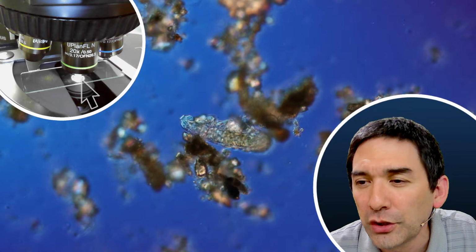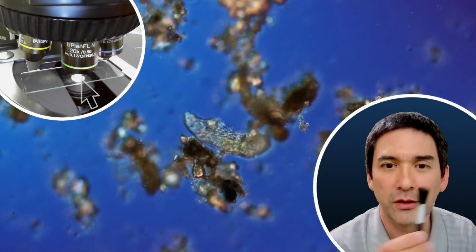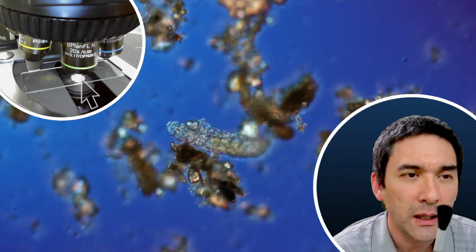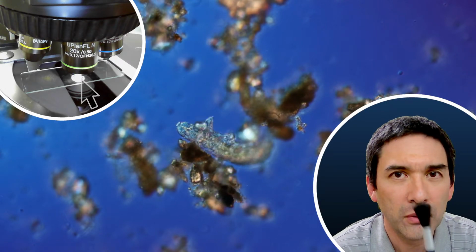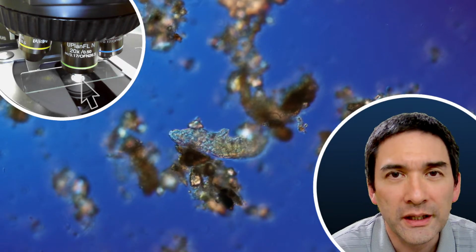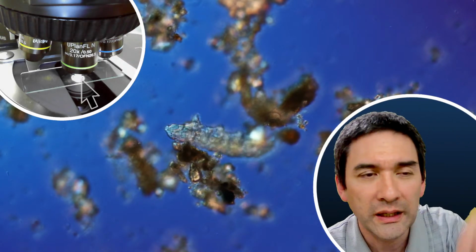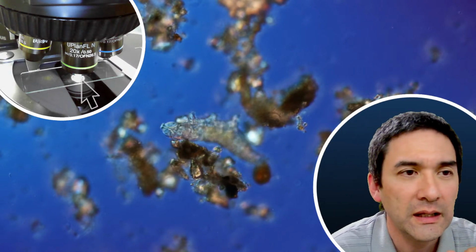What about a brush? The ones for glass surfaces... where's my brush? Look what I got here. Okay. Yes, as a matter of fact, I use this brush here, but I do not use it directly on the microscope objective, because there is no need. It should not become dirty at all anyway, because the microscope objective points downwards, so it does not collect any dust, and it should not get into contact with the liquid anyway.